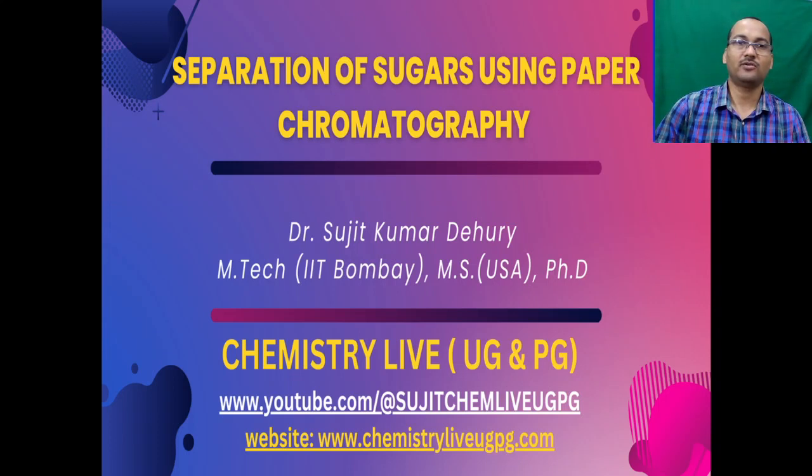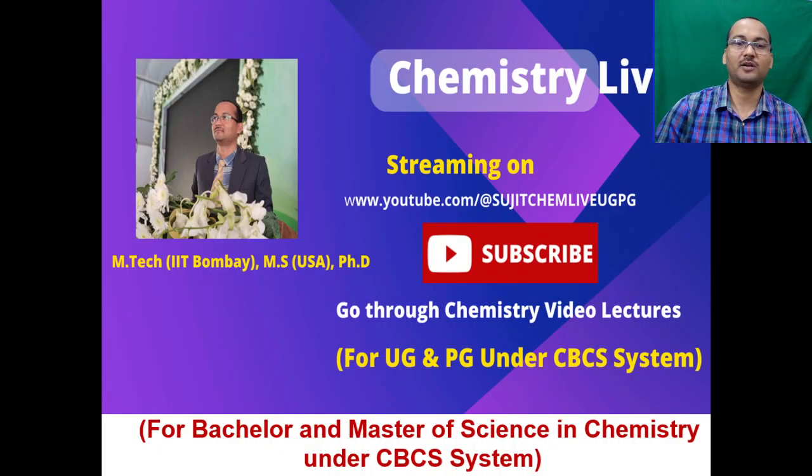So today we are going to talk about separation of sugars using paper chromatography. So this will be highly useful for BSc and MSc chemistry students under CBCS syllabus.